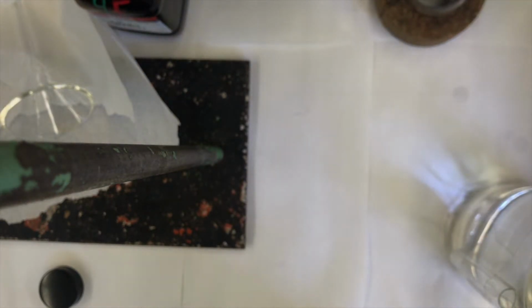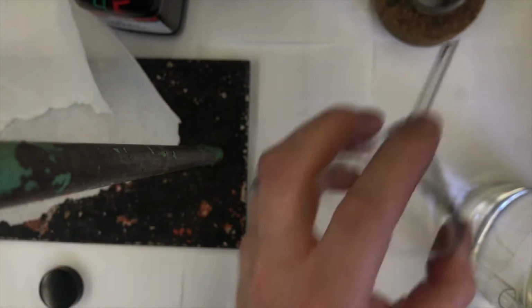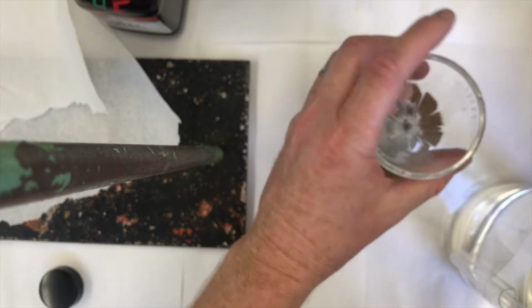Ethyl acetate reminds me of the toy you played with as a kid called Balloonies. I don't know if you've heard of that. When I was a kid, it was fun. I think ethyl acetate's the solvent in it. Has kind of a sweet smell to it.